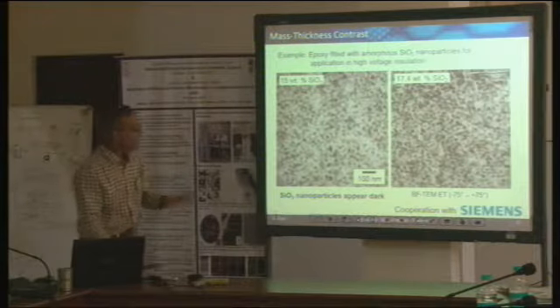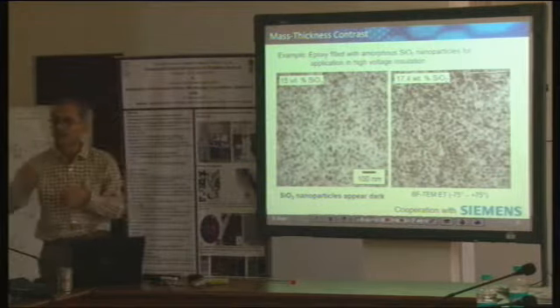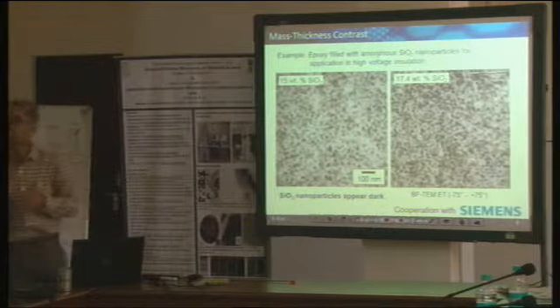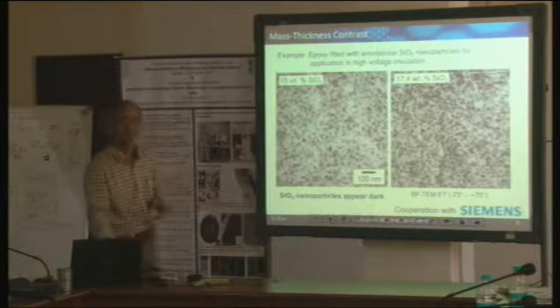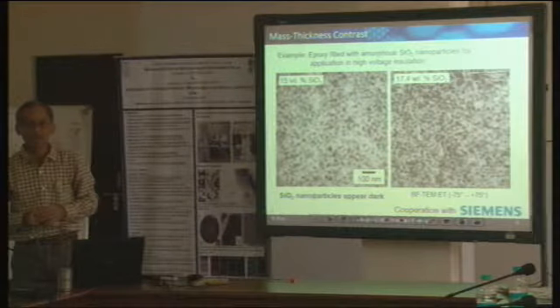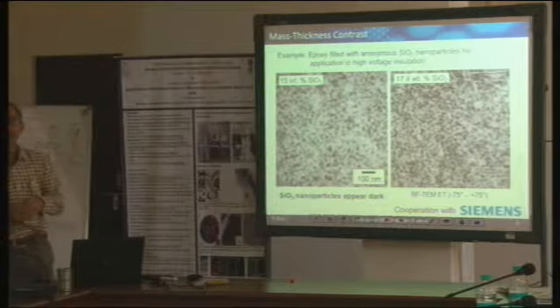So this is clear. Now, I think this movie was working for some time, isn't it? Initially, that was actually a tomography experiment. That is, they tilted this sample inside the microscope and acquired images at different tilts. Why that experiment was done, I will tell you, because you would probably be very hesitant to do that if the silicon oxide nanoparticles were crystalline. Can anybody guess why one would not use bright field microscopy images to make a tomography experiment in this case, had these silicon oxide nanoparticles been crystalline?